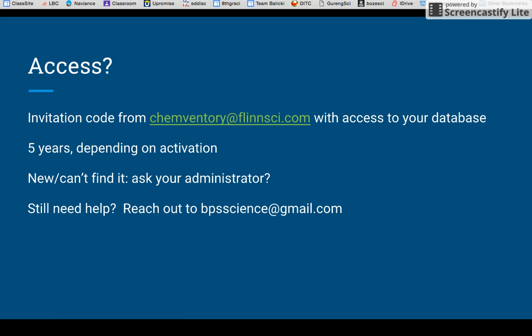If you were not at your school, if you were not teaching at that time, a building administrator was also included in those emails. If there's no digital paper trail, so to speak, that you can find your activation code for Chemventory, reach out to bpsscience@gmail.com and they'll help get you connected, because every school and therefore every chemistry teacher should be connected to the Chemventory databases.